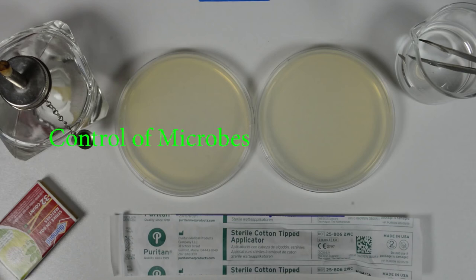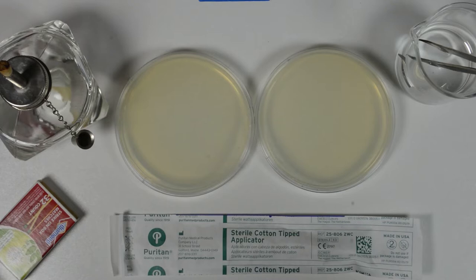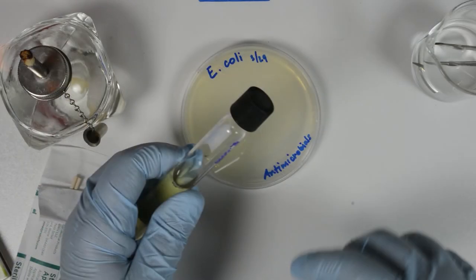This video is part of the Control of Microbes lab. This video will particularly deal with the setup of Kirby-Bauer tests to assess the sensitivity of a bacterium to antimicrobial agents. We will follow the standardized procedures for this setup to ensure reliable results.